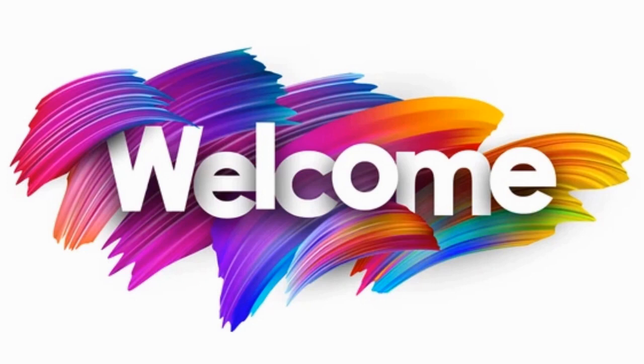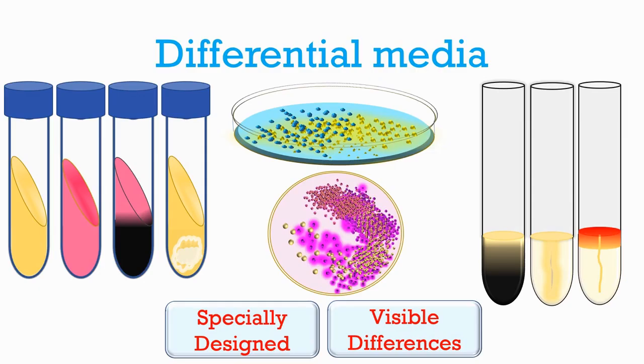Hello, welcome back. In this video, we will cover the differential media that are commonly used in microbiology labs. Differential media are specially designed media that help the microbiologist to differentiate among various types of pathogenic bacteria. It is done with the help of certain chemicals in these media.